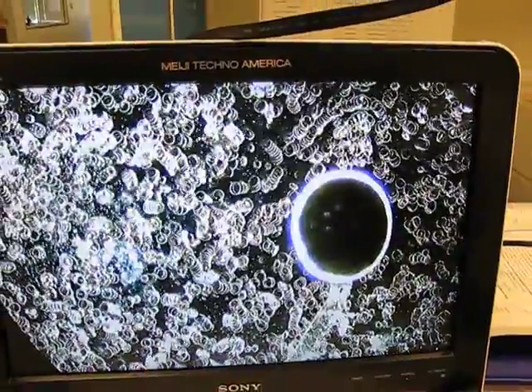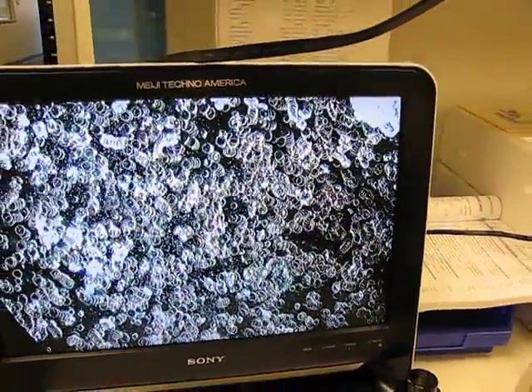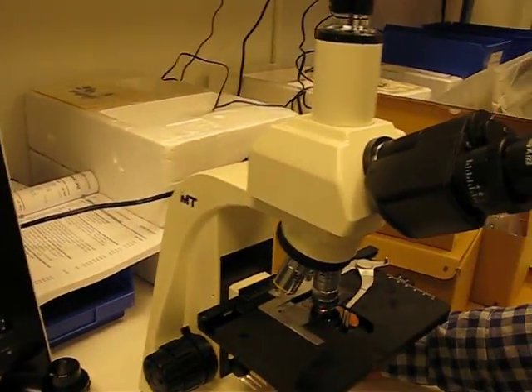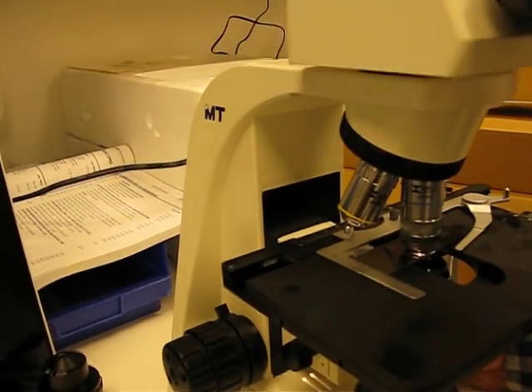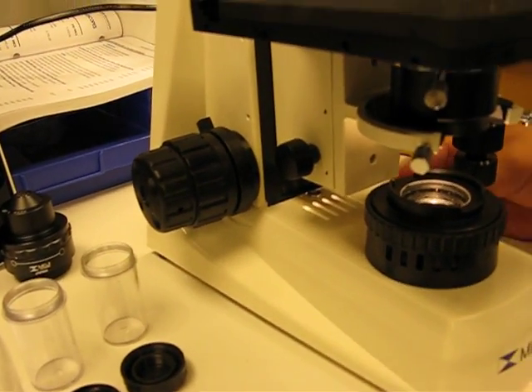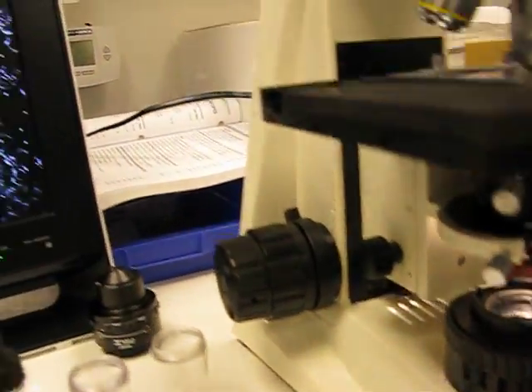Let me scroll — big circle in the middle — and then let me change the focus and adjust. Empty 5300 on a 50x with dark field halogen illumination, dark field cardioid condenser MA914. I'm going to adjust the height of the cardioid condenser.